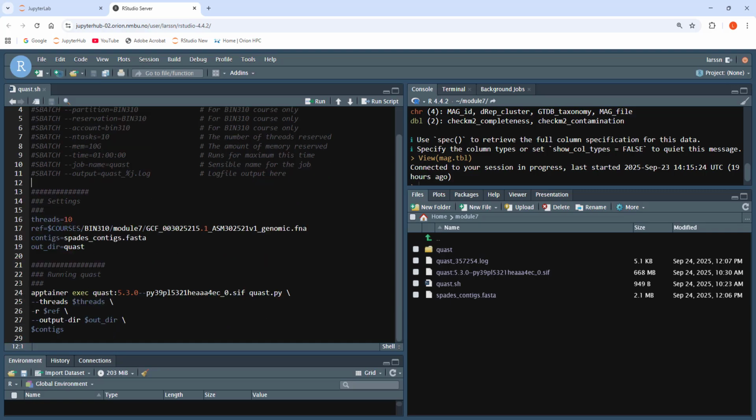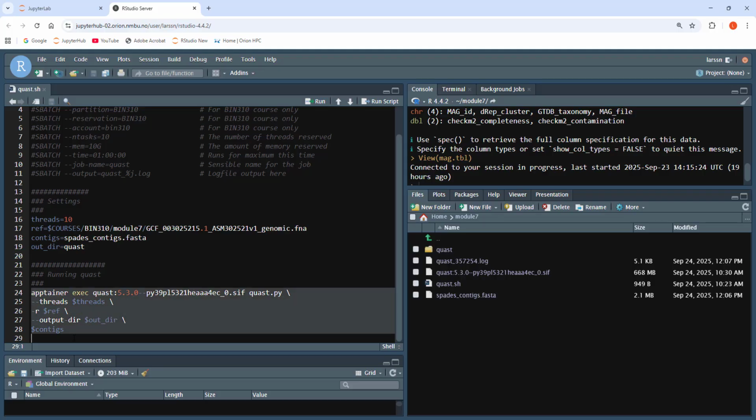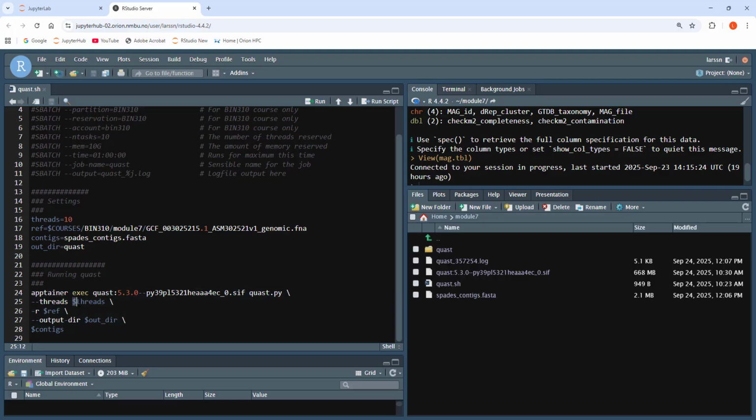When it comes to the command line itself, we can see that it refers to some shell variables, right? This is how you refer to the content of a shell variable, with a $ sign first, and they are colored blue as well. And of course, for this to work, these variables must have been created and filled with some content. This is something you should immediately realize when you see this code.